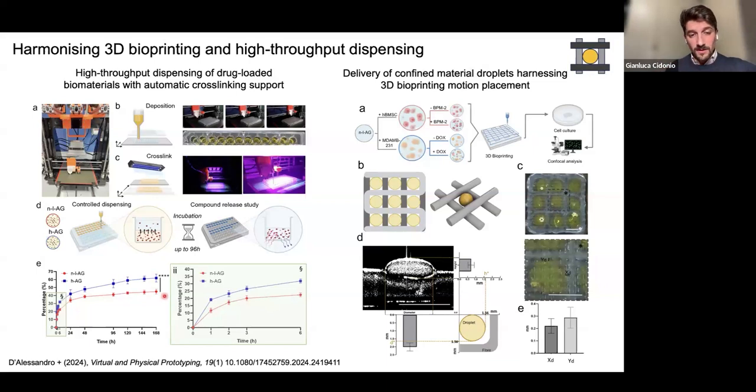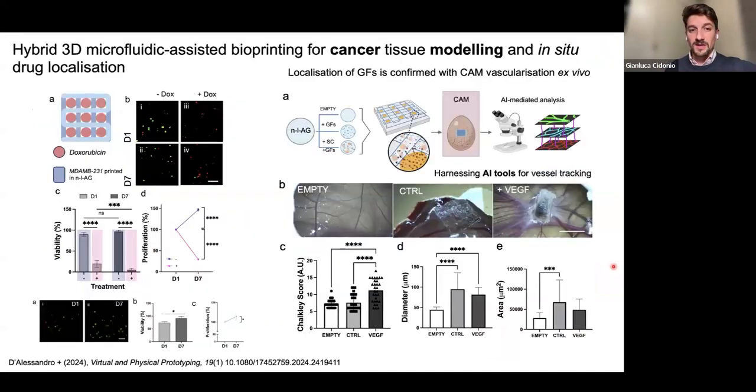After confirming that the nanoclay is helping us to retain the drug, we dispense the system in a kind of spherical way. You see the macroporosity of the printed structure. We printed in gray, you see here. Hopefully you can appreciate that the yellow system is the compartmentalized drug. So the drug is inside a nanoclay based material, and we are hoping to restrain it in that compartment.